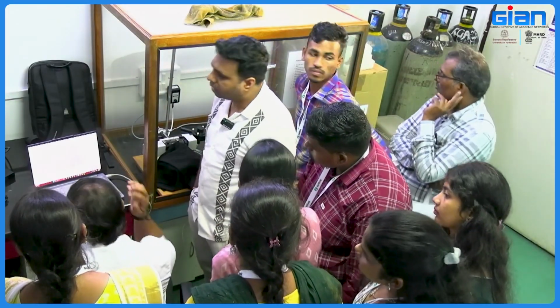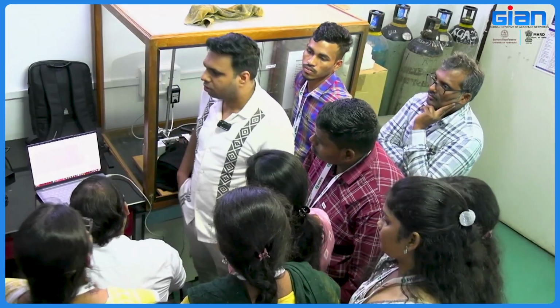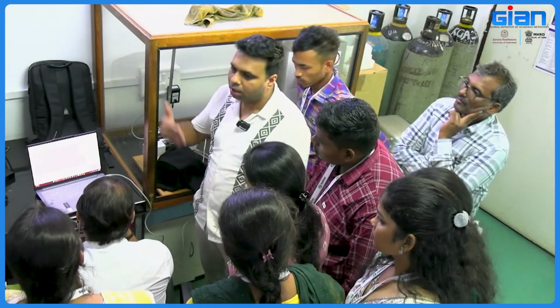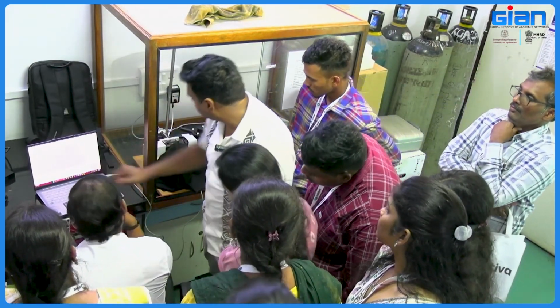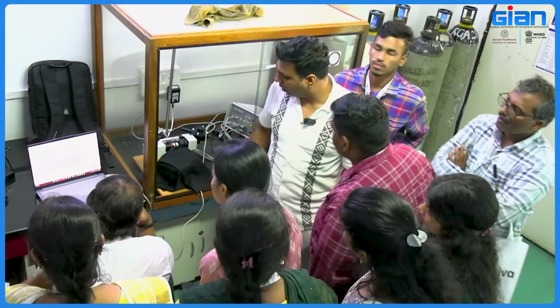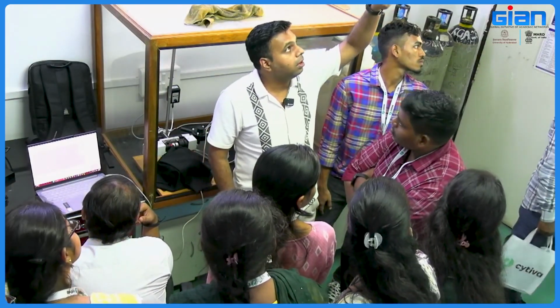For that, writing a script file is necessary. If I start to explain that, it will be very long. So for now, this is the default. A 30-second exposure will be there. After 30 seconds, a saturating pulse, then a higher incremental power. So now it is running at 48. You see every time it will flash a light. It's recording now. You can switch off one light, this big one.